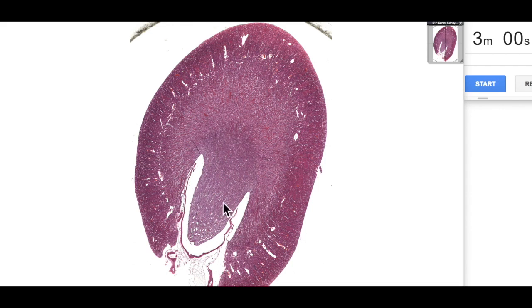Here's the renal papilla. This is part of the renal medulla. And what we're going to be focusing on in this video is the renal cortex, which is this region on the outside, and having a look at the fine detail there.